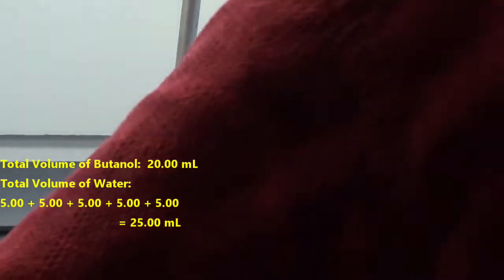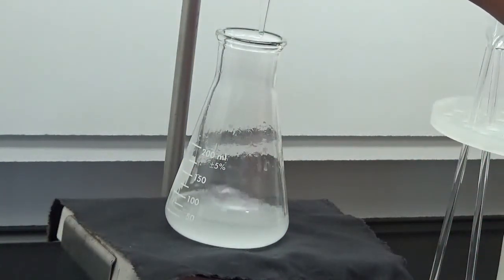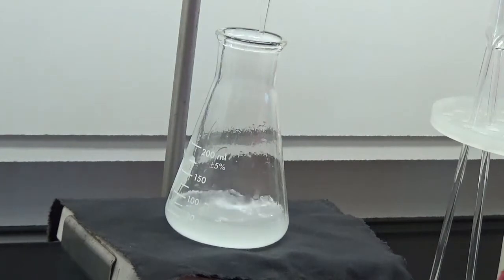Okay. Dropping in very slowly but continuously until I get bored and want to make it a little faster. Let's stir. How to get a good stir.